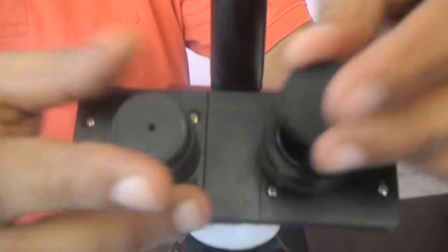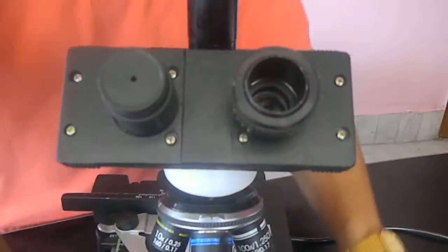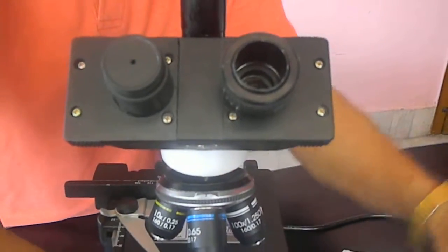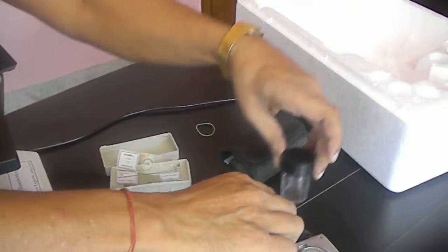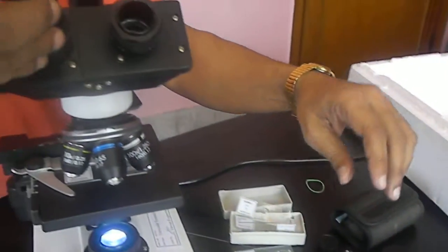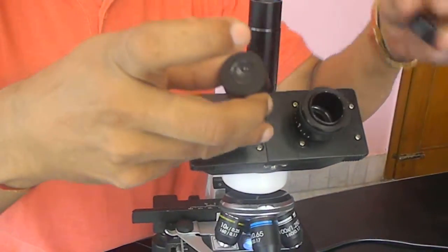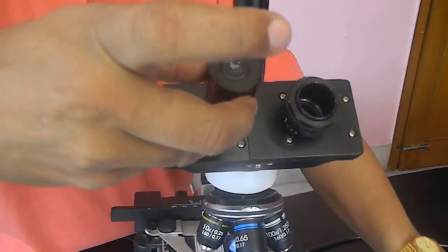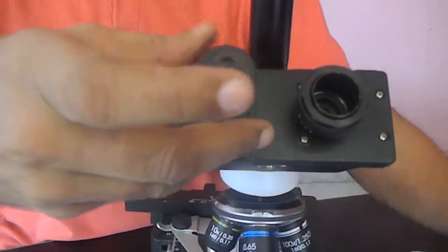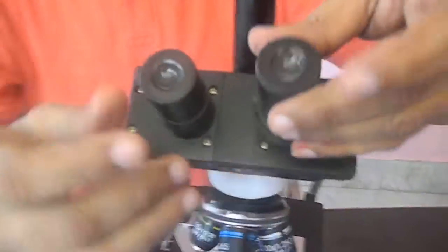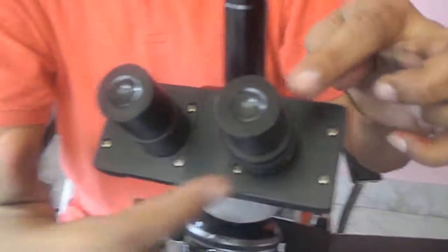There are eyepieces to be placed on this. There are two eyepieces available with us. One we put in one eye and another we put in the second eye. So both the eyepieces are put here.